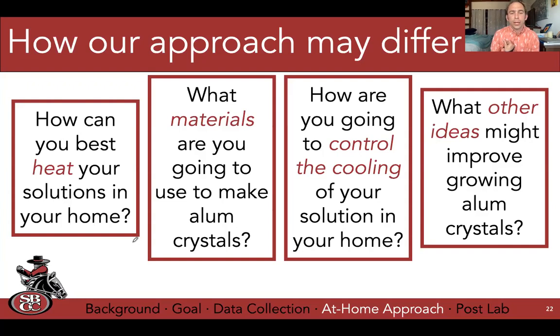That's what I ended up doing, was I saved everything. And there's sometimes crystals that grow on the bottom of your containers. You can heat those up and get that alum back into solution too. So yeah, you can just keep adding alum.